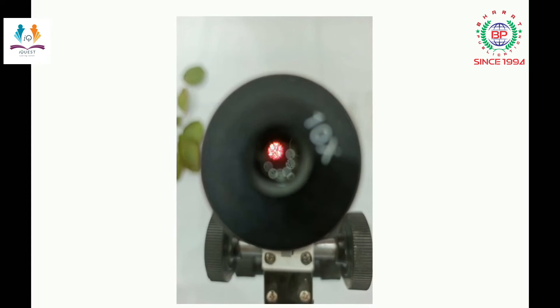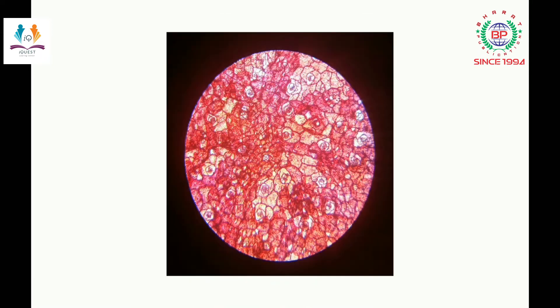When you check the slide under the compound microscope, you will see this type of structure. You can see small stomata as well as the cells present around them. These are the stomata with the guard cells. There are so many stomata which you can see in this temporary slide under the compound microscope.